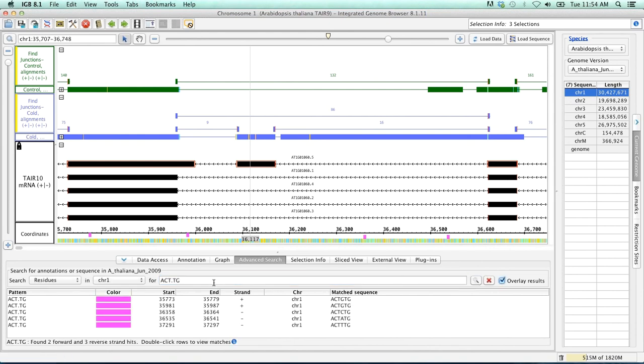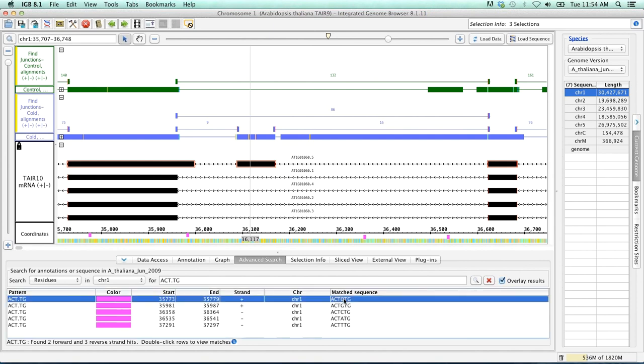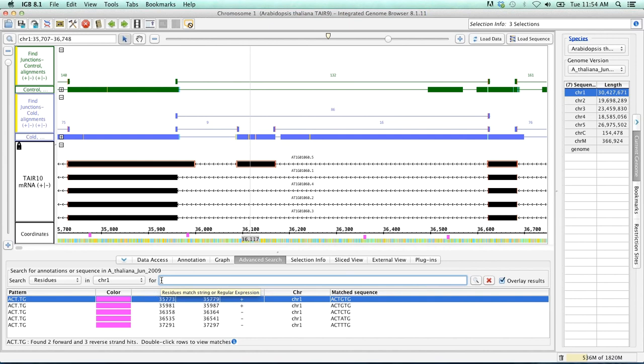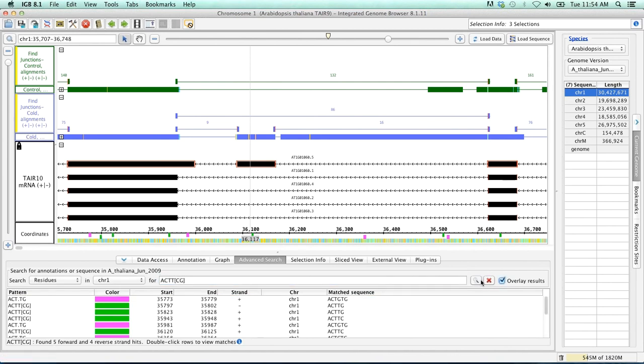So if we go ahead and search for this, we will see that the pattern here can be anything, and it's found these very quickly. Similarly, if you had a motif where it was ACTT followed by either a C or a G, you can use brackets and then determine exactly which nucleotides this will be. So this will be ACTT followed by either a C or a G. And so we can see here our pattern, ACTT, and then either a C or a G, and it's loaded these as well.